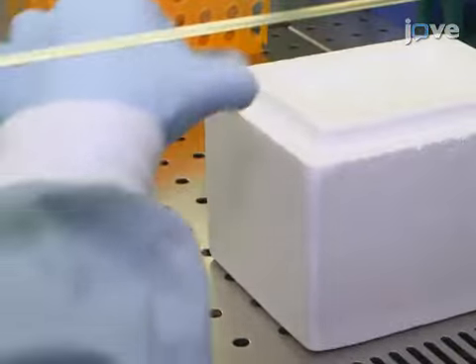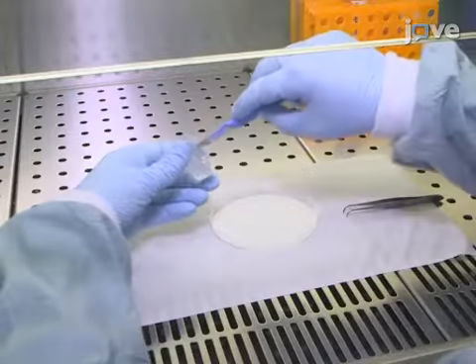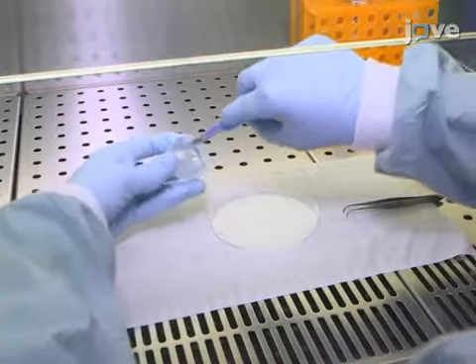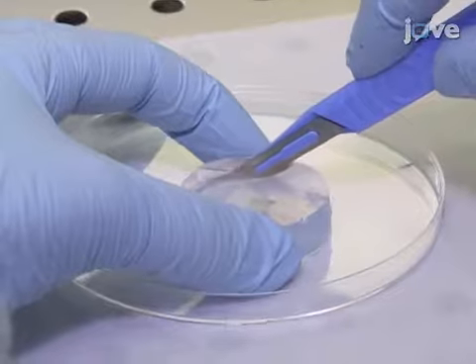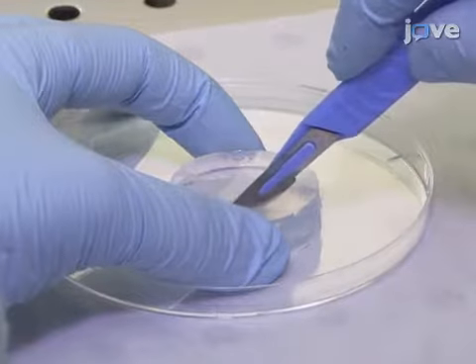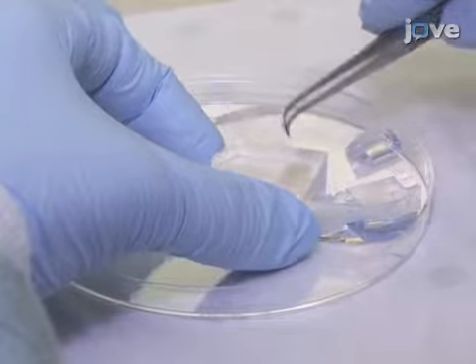Leave the agarose gel on ice for 5 minutes to solidify. Once the agarose solidifies, invert the plastic dish. Using a spatula, release the entire gel. With a sharp blade, trim the excess agarose surrounding the tumor fragments, leaving 3 to 5 millimeters of gel around the tissue.